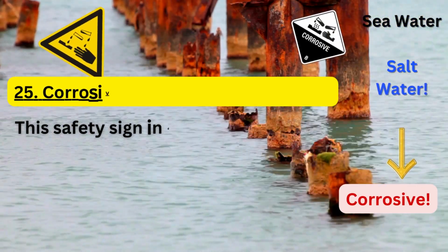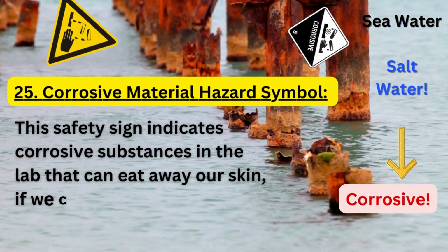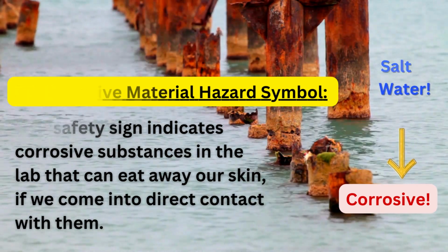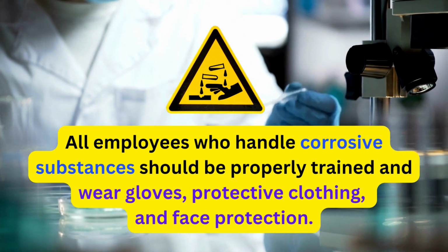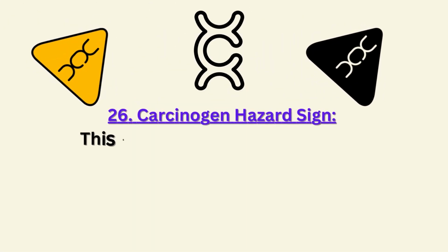25. Corrosive material hazard symbol. This safety sign indicates corrosive substances in the lab that can eat away our skin if we come into direct contact with them. All employees who handle corrosive substances should be properly trained and wear gloves, protective clothing, and face protection.